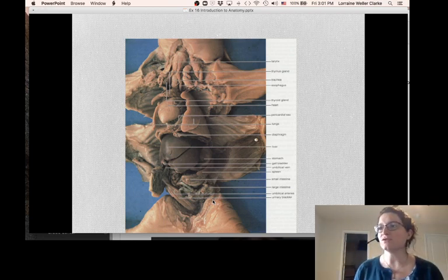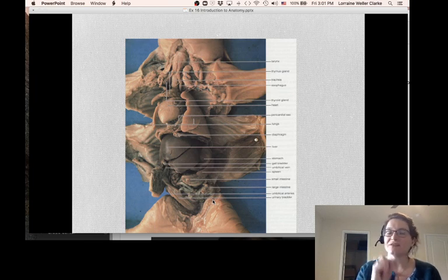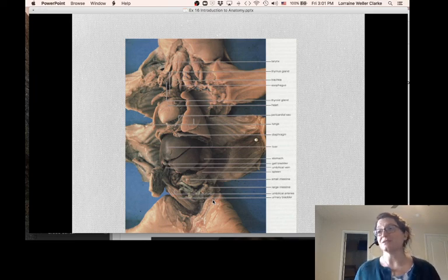Okay, so that is your first online pig dissection. Again, you gotta watch the videos. I'm not actually dissecting a pig in front of you. I'm just pointing out how to walk through the video. Go back, pause me, go back to go to the different sections. Look at the pictures. Watch them open the pig. It's gross, but you don't have to do it yourself. So, there is a benefit to that.